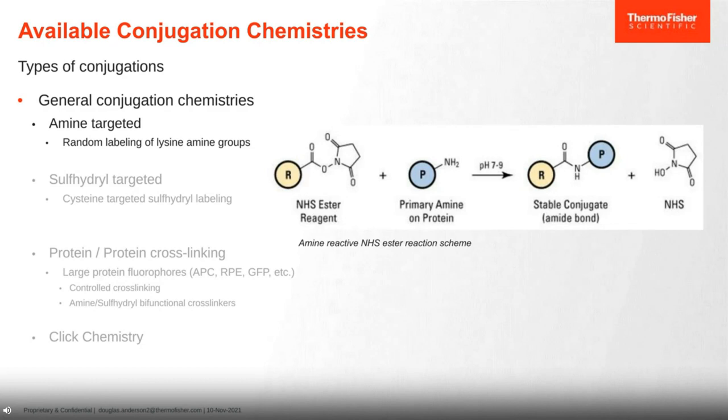There are other reactive groups that you might see on the market. Generally speaking, they all more or less do the same thing, some of which are a little less susceptible to water hydrolysis, but in general, all amine-targeted chemistries like NHS ester, SDP ester, PFPs that you'll see on the market all more or less target the amines in the same way and have similar reaction conditions.